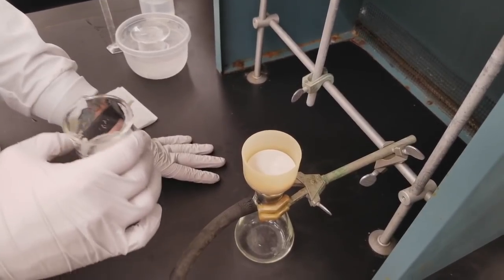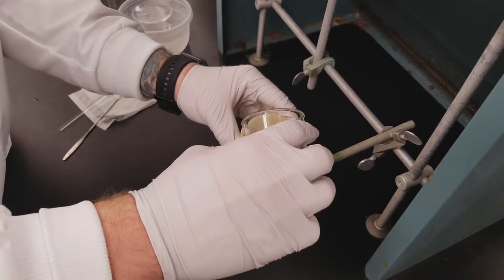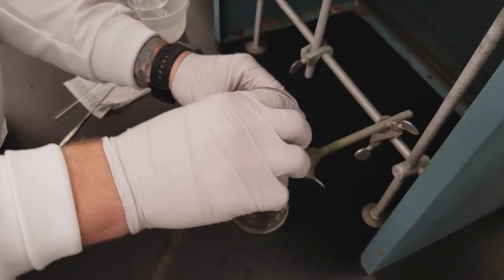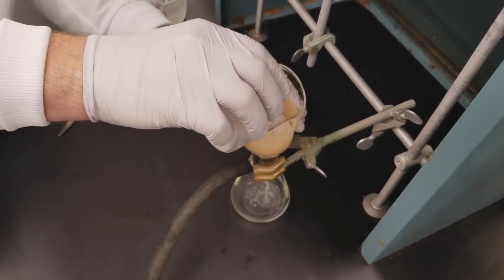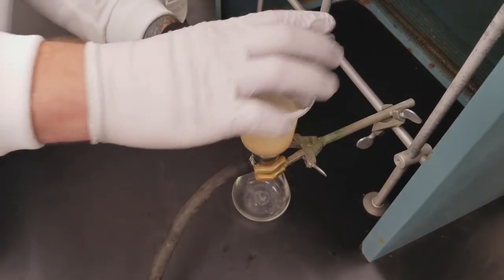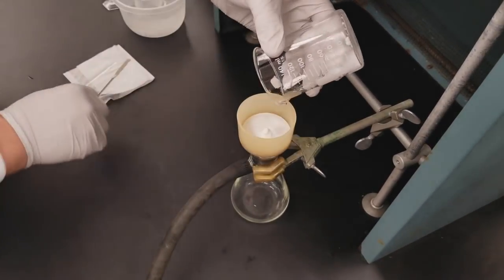So you want to swirl your beaker that has your solid in it, agitate everything and then just pour it over. You want to pour it toward the middle of the filter paper, that way your solid doesn't get sucked underneath it.